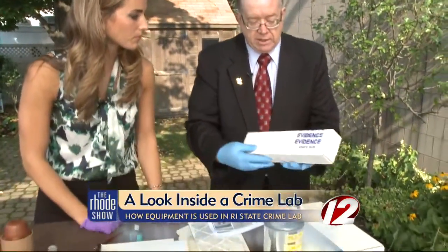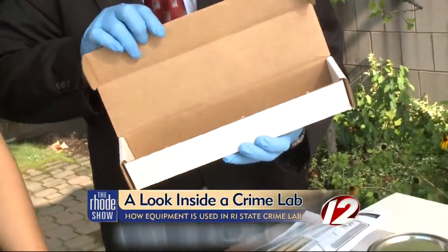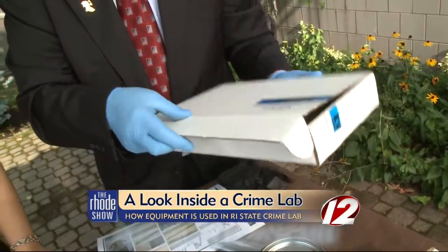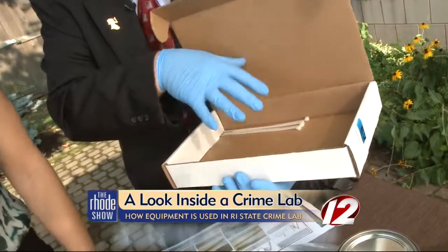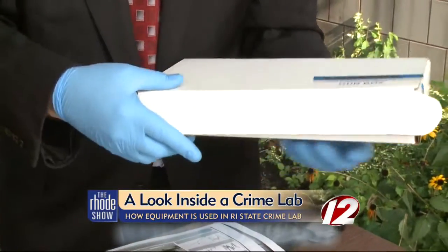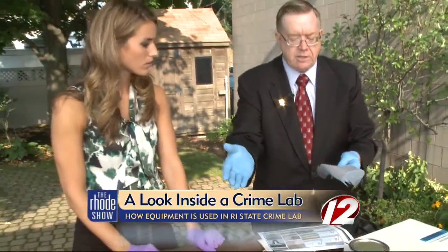So what do we have here? We have a box here, something you would put a knife into — you tie it down so it doesn't rattle around. We would use this as a gun box. The gun would sit in here, a magazine if it's semi-automatic, they'll all be tied down so it's not rattling around. Plastic bags can be used for cartridge cases and bullets.